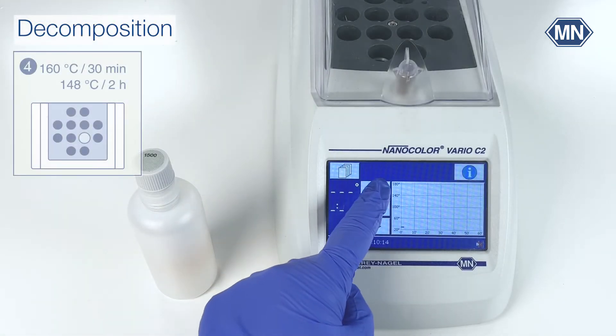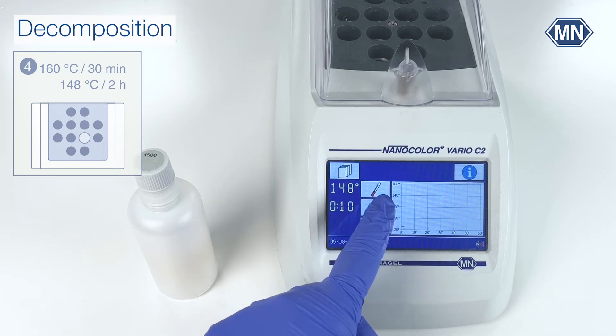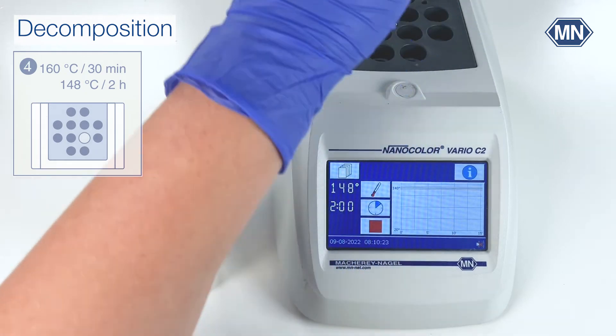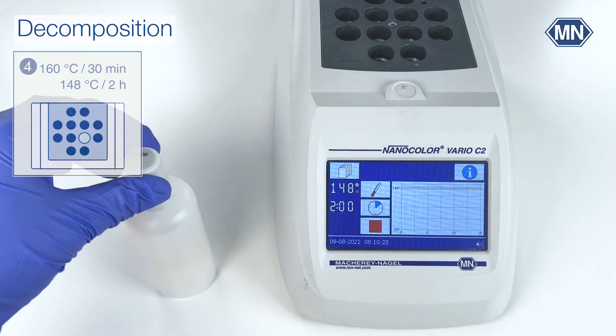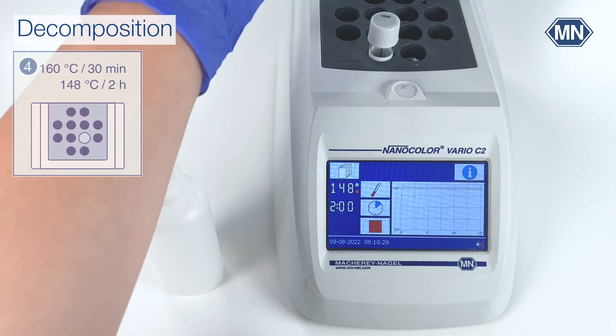Program the heating block to 148 degrees Celsius for 120 minutes. Place the test tube into the heating block and start the decomposition.